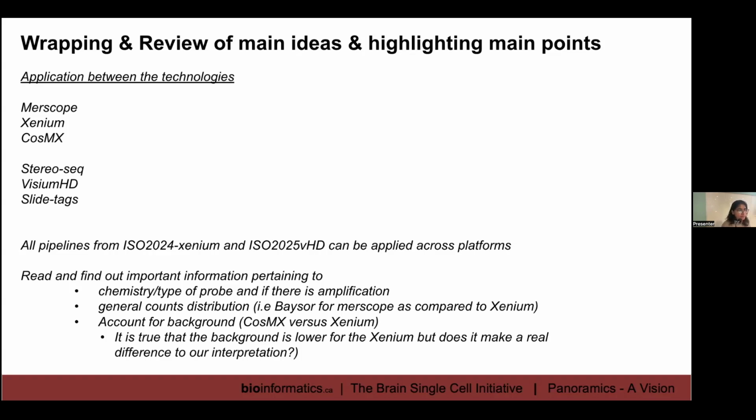And of course, all of this is going to affect what type of methods you use. Some methods are better on some platforms. For instance, Baysor works very well if you have a MERFISH data set, which is what I have found, but it didn't work for me with the Xenium. It was either over segmenting or under segmenting. It was very often seeing doublets as opposed to singlets, right? So this is not an issue with the package.